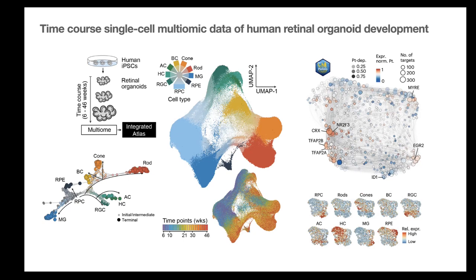From the cell states you can also construct trajectories, where the progenitor cells develop into Müller glia, ganglion cells, amacrine cells, bipolar cells, all the cell types I've already shown you. Finally, the UMAP projection of the whole thing is a dog, so I don't know what this says about vision, but that was the data set we wanted to combine with our spatial data set.